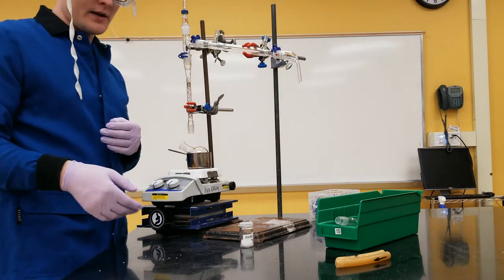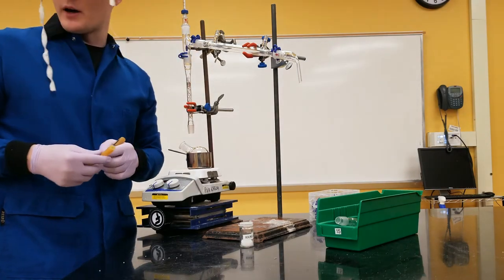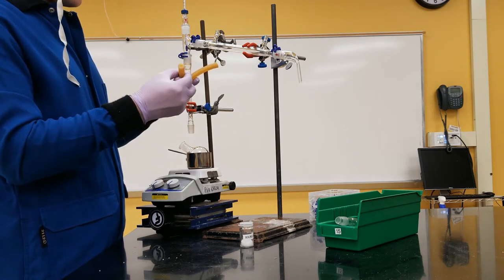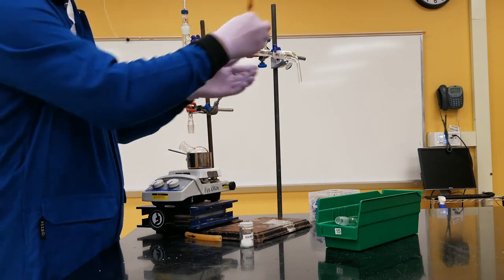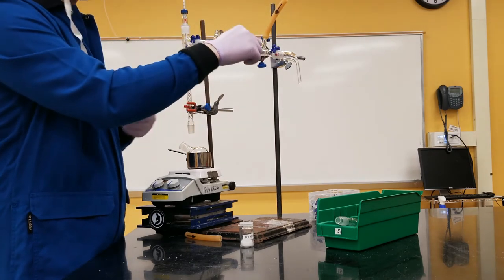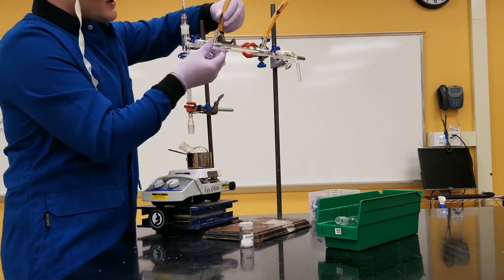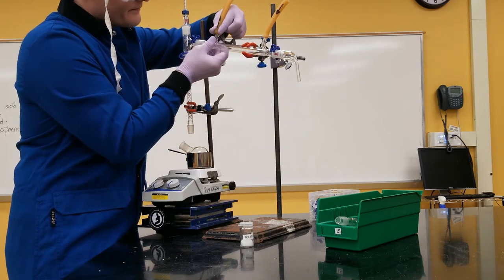So before this thing's ready to run, I'm going to have to hook up the water jacketed condenser to a source of water. We just have hoses coming out of sinks here. So one key point of success, I guess, for getting a water jacketed condenser to work is that you fill from the bottom. So the water is going to come from the sink into the bottom nozzle, and then it has to fill up this entire volume with water before I allow it to run out into another hose, which I'm just going to run into the sink out there.